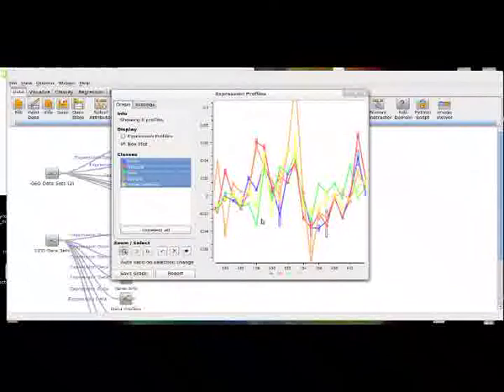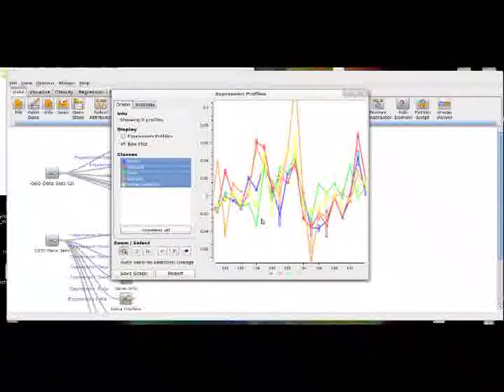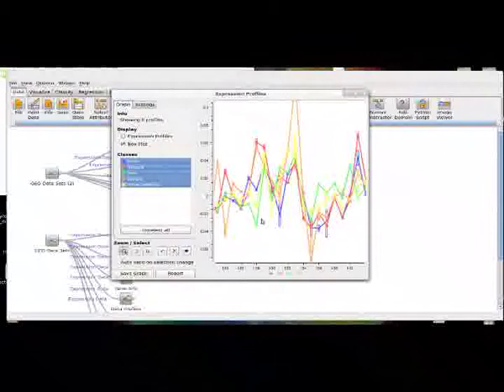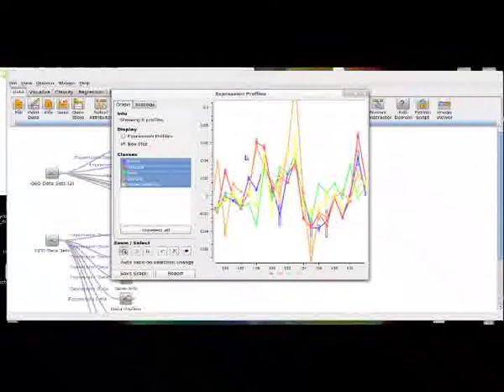Each differently colored line indicates one of these samples is from a different tissue type. So this is one other way that the bioinformatics add-on can help you visualize bioinformatics data, which is, if you can get it in the right format, is nice. But luckily enough, the GeoDatasets widget allows you to access to a large repository of bioinformatic data examples that seem to be in the perfect format for analysis with the tools in Orange.